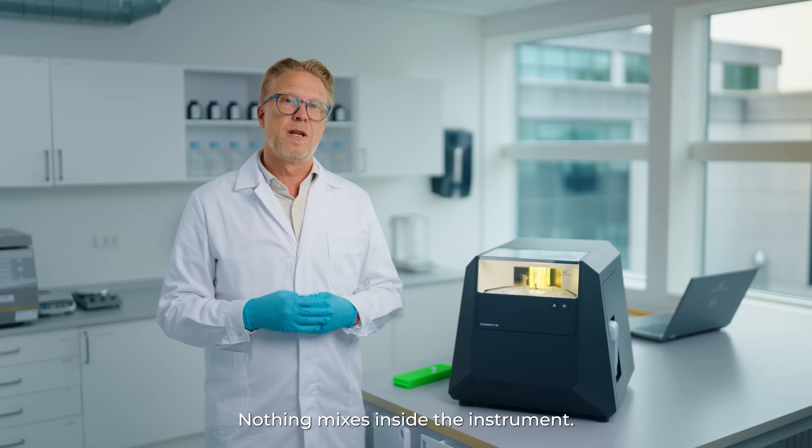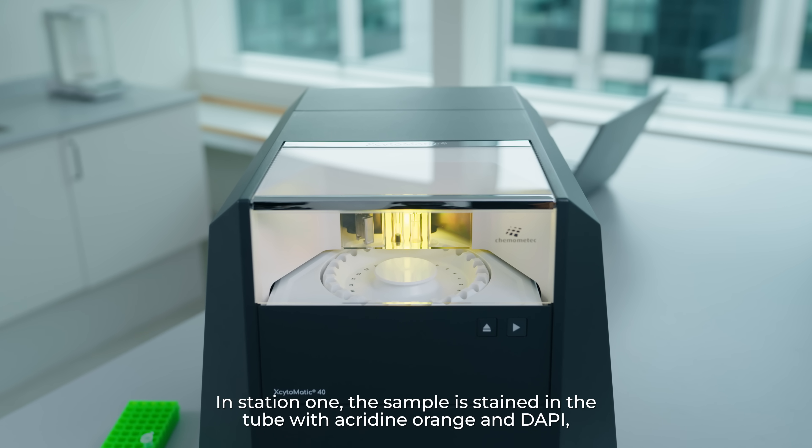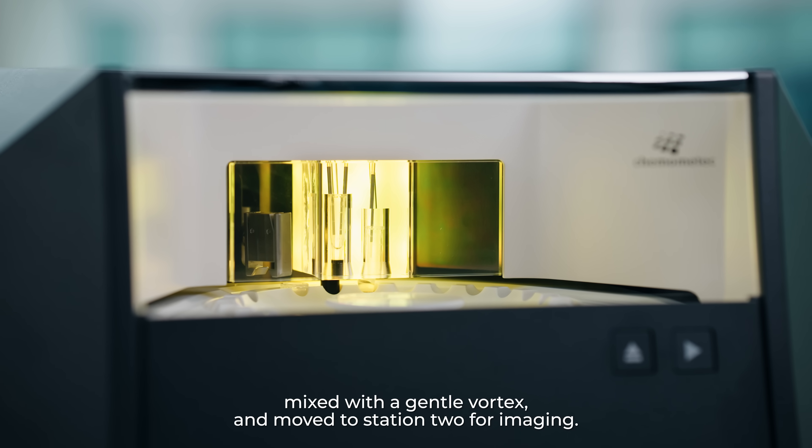Samples go through three stations. Nothing mixes inside the instrument. In station 1, the sample is stained in the tube with acridine orange and DAPI, mixed with a gentle vortex and moved to station 2 for imaging.